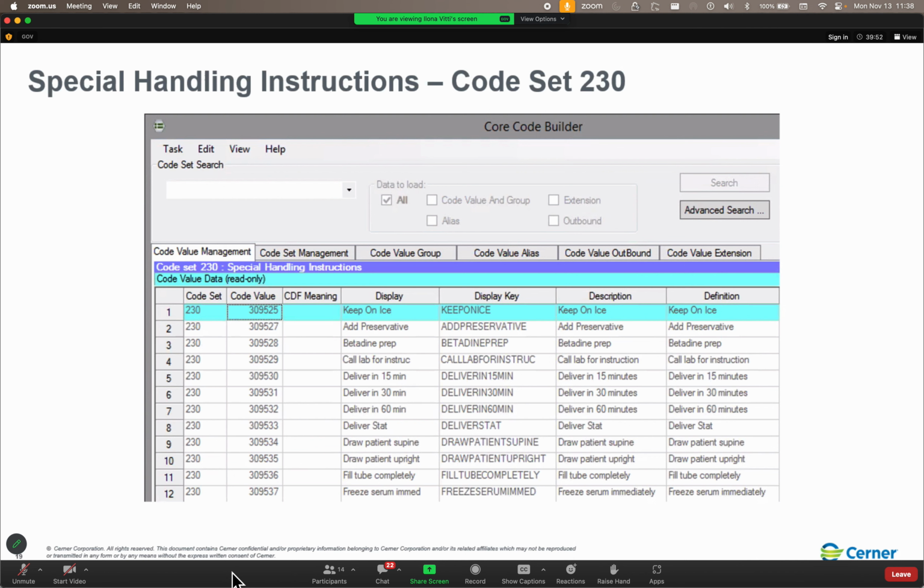For the sub-activity type drop-down box, I want you to select chemistry, and then with all orderable items selected, open up that drop-down box and find your assigned orderable. My assigned orderable is vitamin D25. Let's see what we see here on the screen. Once you find your assigned orderable, we can see the specimen type. In this case, we've got blood. The accession class is blood.